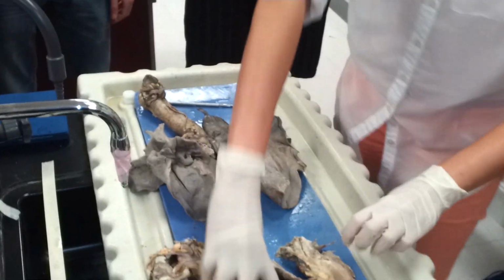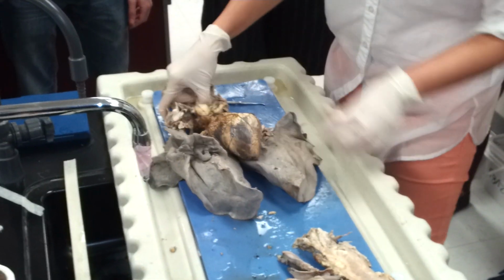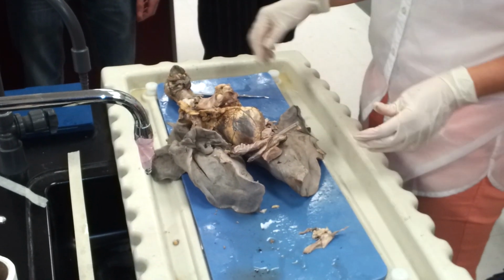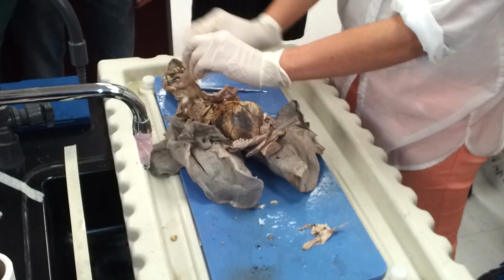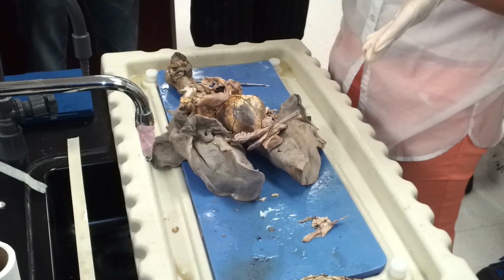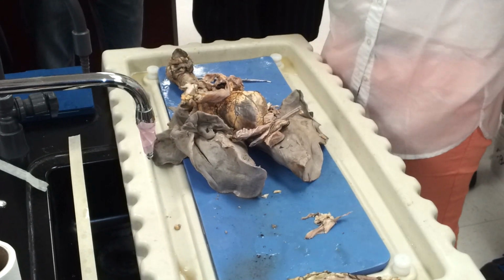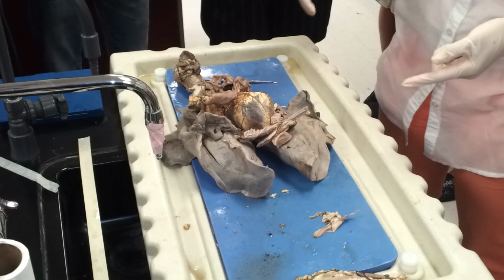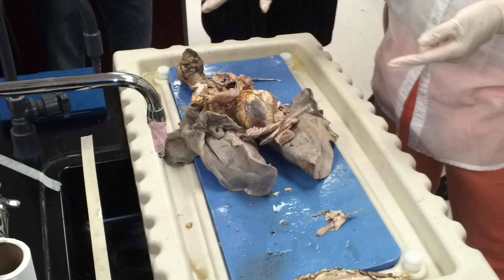Okay, so if we put this all back together, it was like that. Don't worry about that thing. Okay, so this is the sheep. Imagine the sheep laying on its back so its feet are up in the air. This is the ventral portion, so this is the anterior of the lungs.